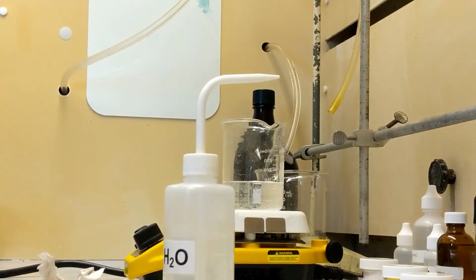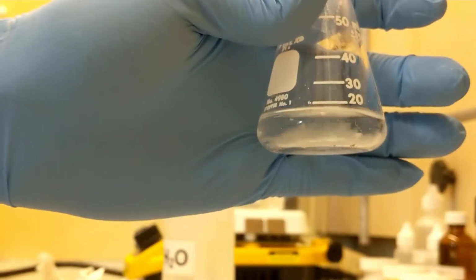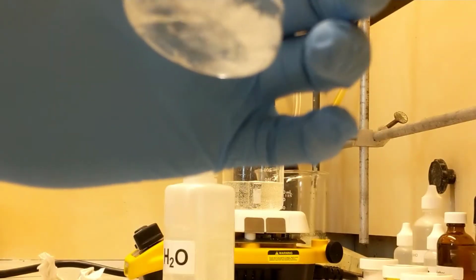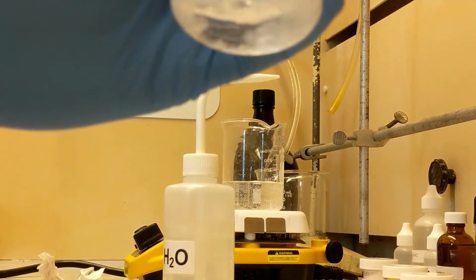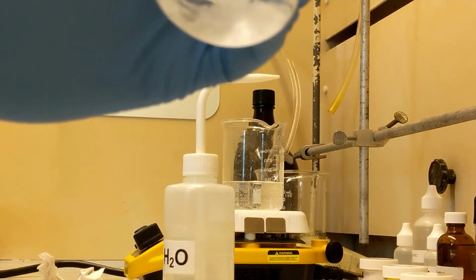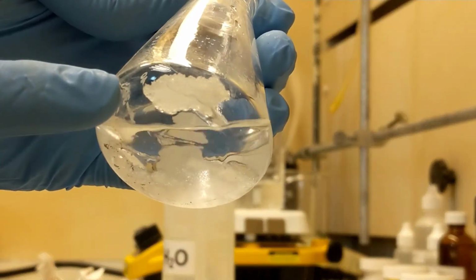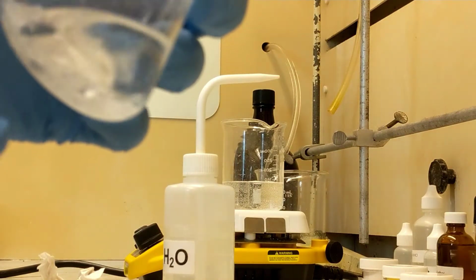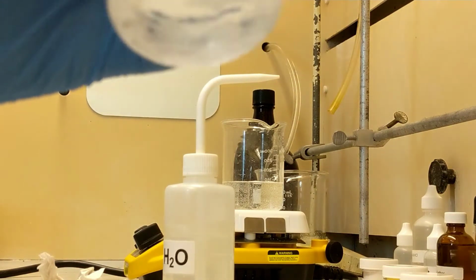So, I want you to look with me. If we look there, I'm not seeing as much of a line. If I look down at the bottom, you see how it's clumping down there? That means it's still soaking up water, right? So this sodium sulfate soaked up that water into there. But you can see all these free crystals, they don't have any water to soak up, right?